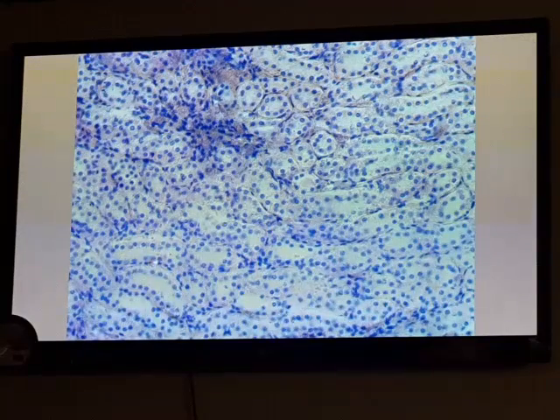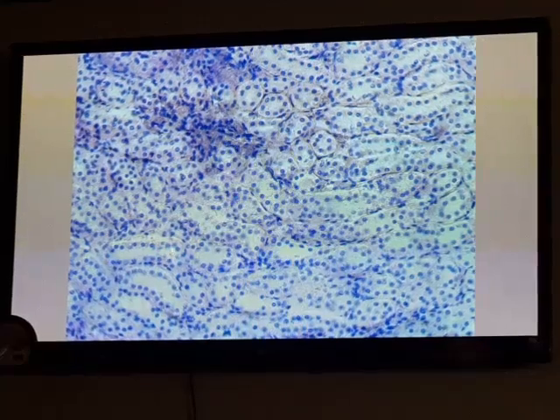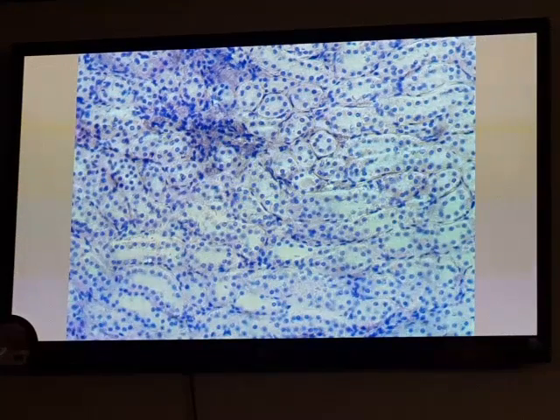This is in the cortex of the kidney. In the medulla, we demonstrate tubules. These are collecting tubules, also lined with simple cuboidal epithelium. These cells stain weakly. These appear as lightly staining cells. This is the collecting tubules.